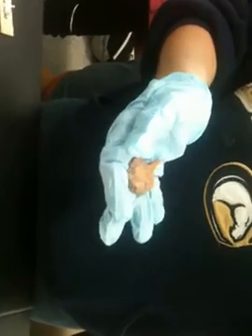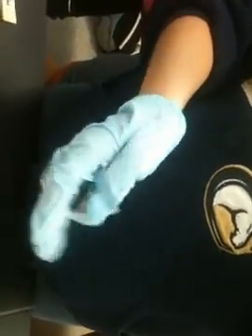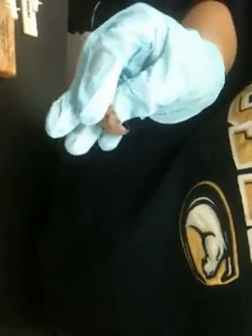And so let's see if we might be able to find it on here. So this one's got too much tissue intact, but I'll show you that when we look at the intact retina. I'll show you one that has an intact optic nerve exiting. And then let's see if we can find it on here. So see how it's all connected right now? Right there, that's where the optic nerve exits and the blind spot is.